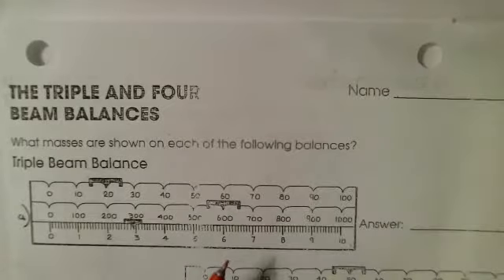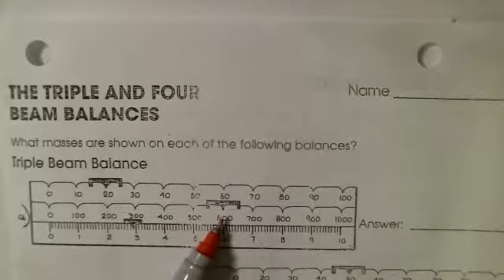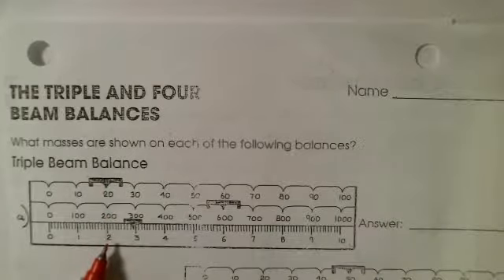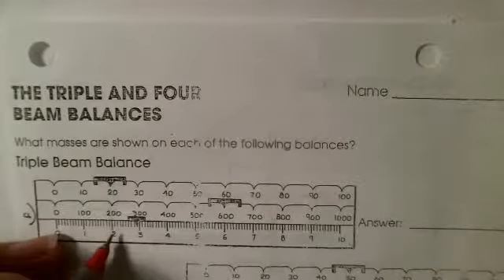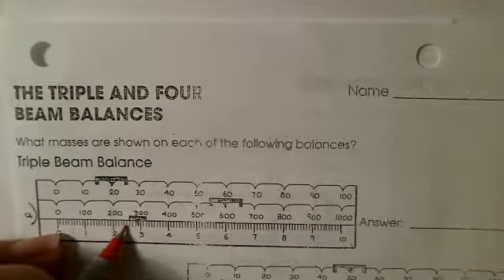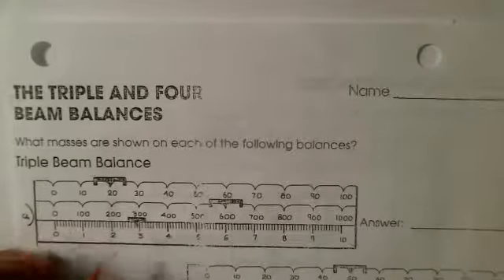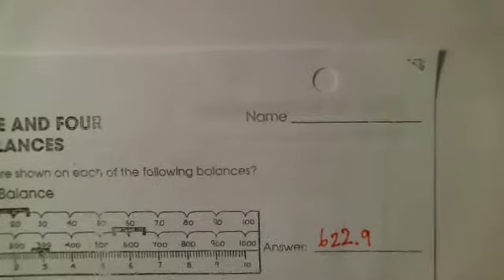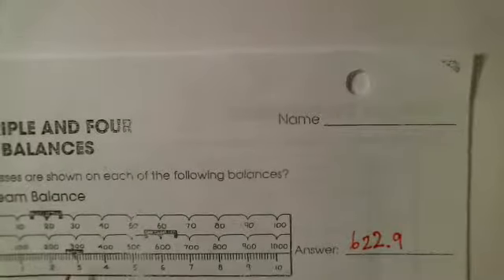So let's read this one. This is going to be 622. Okay, so we can definitely tell it's 622.9, but we need to estimate one more spot.